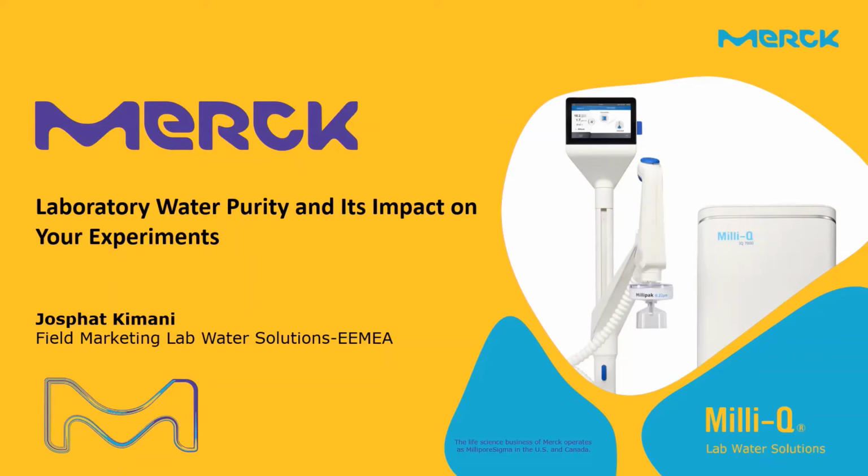However, I would like to just mention a few facts about water, which are very important for us to underline. I'm pretty sure you already know this, but water is so often used in the laboratory that most of the time it's taken for granted. But I want also to mention that water is the most widely used reagent in the laboratory. So every analysis that is performed in the laboratory, water will have some impact on it.